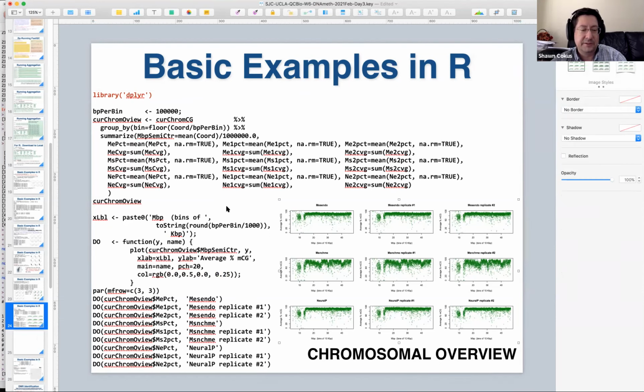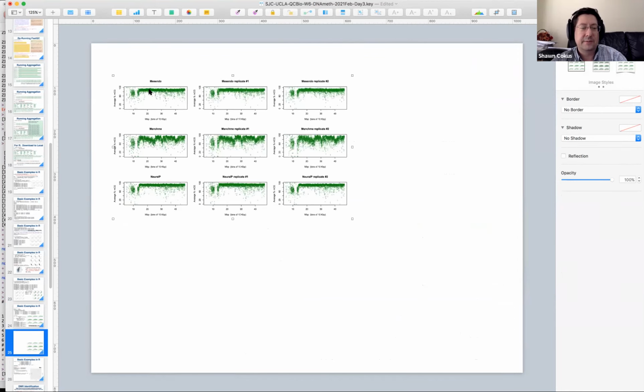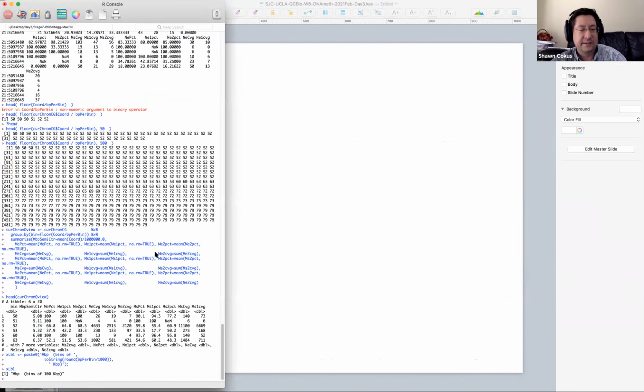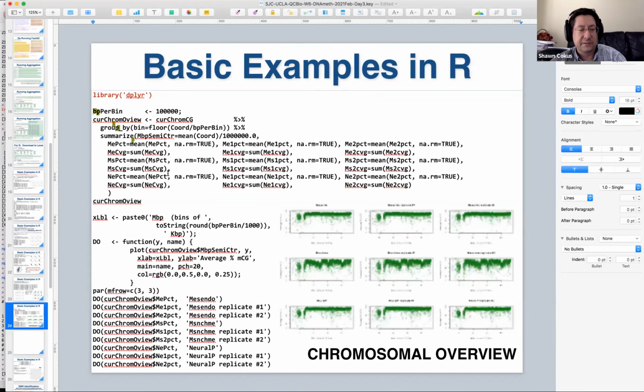come on, you can do it. Now you're going to grind on that. I know, I'm not too happy with that. That's a hard plot for you to make. Maybe okay, I'm going to delete that one because I'm thinking hard about it, and generate the 100 KB version instead, which takes less work for the machine.